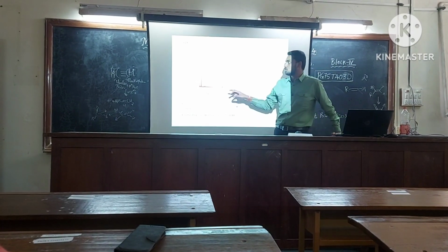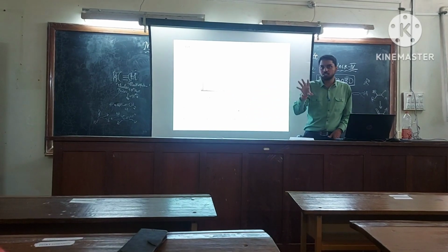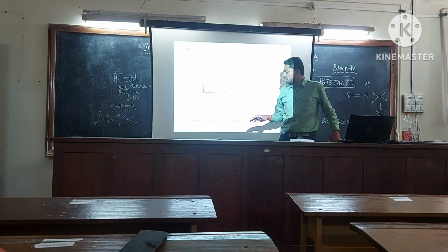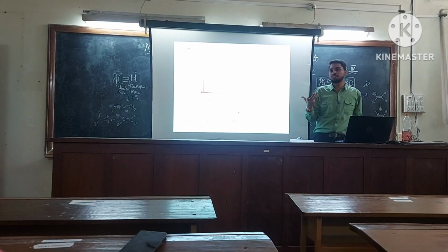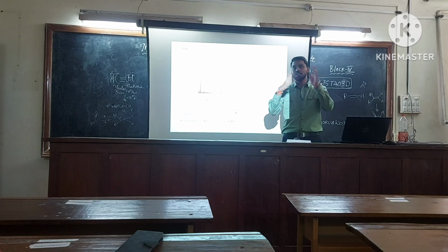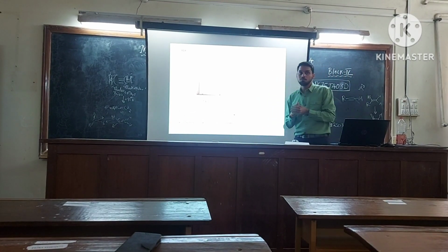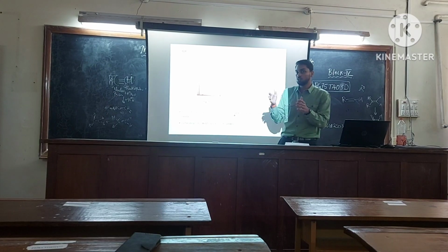So here we have got sodium as the peak. Though we have copper oxide, so copper and oxygen obviously will be there in this peak. And carbon, since we have taken the leaf, the leaf extract will definitely have organic content, and from that the carbon might have come. But what about the sodium? We have used sodium hydroxide as the stabilizing agent and also to maintain pH.